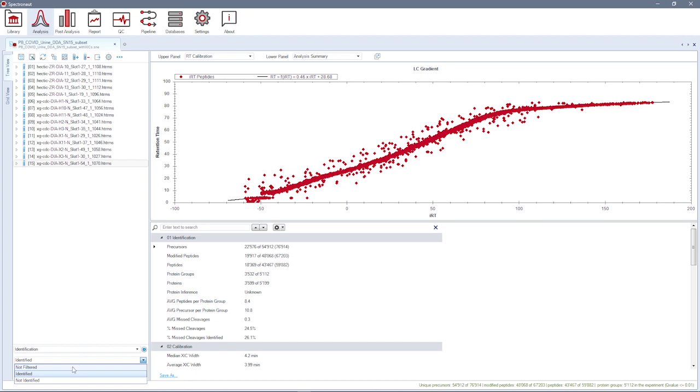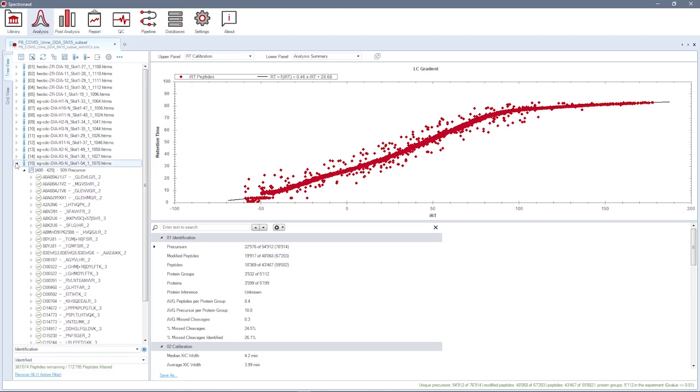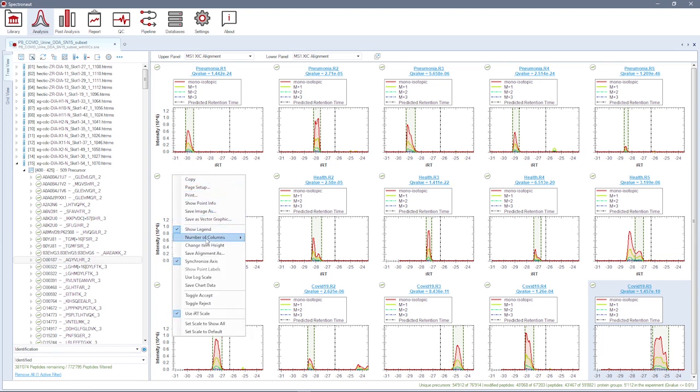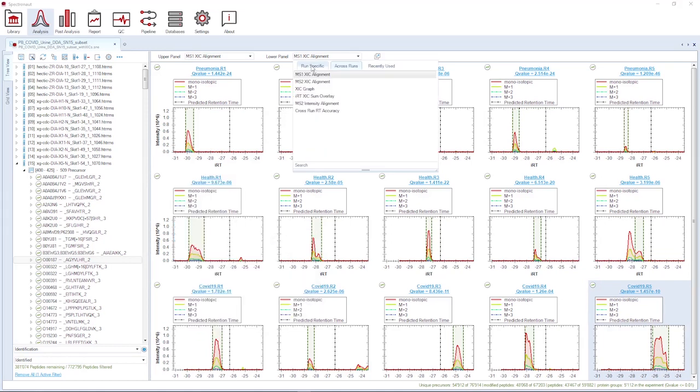If you go to the precursor ion level, you can now visualize a precursor's XIC across all the samples. This new visualization allows you to easily and quickly browse through thousands of XICs at a glance and navigate between them with ease. By right-clicking on the panel, you can also sort the grid by experiment conditions and replicates. Conditions are sorted in rows and replicates in columns. From the cross-runs plot, you can change to run-specific plots.